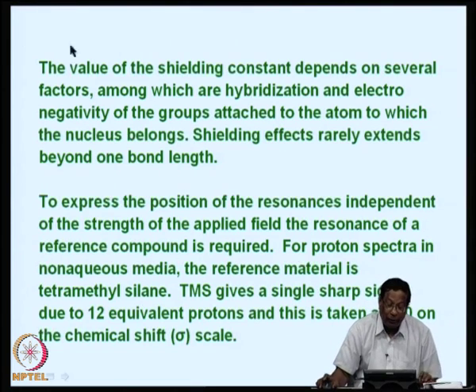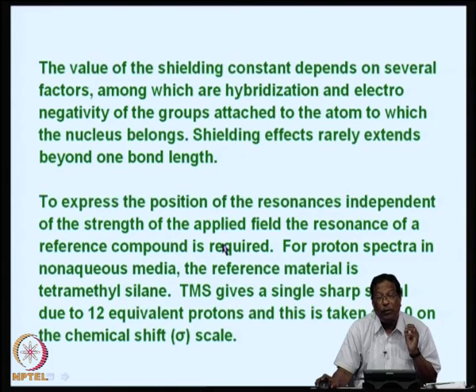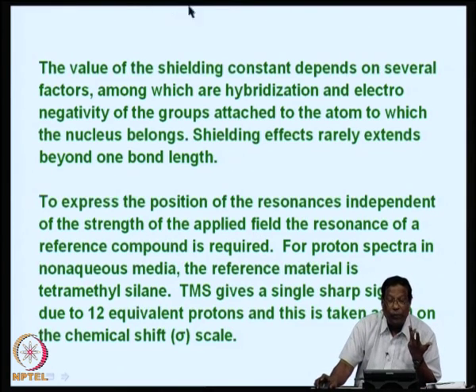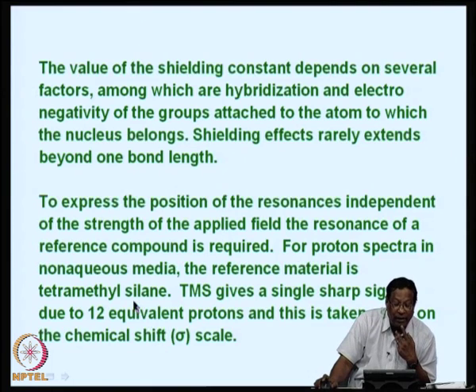So, to express the position of the resonances independent of the strength of the applied field, the resonance of a reference compound is required. For proton spectra in non-aqueous media, the reference is tetramethylsilane. So, this does not have any other hydrogen groups.